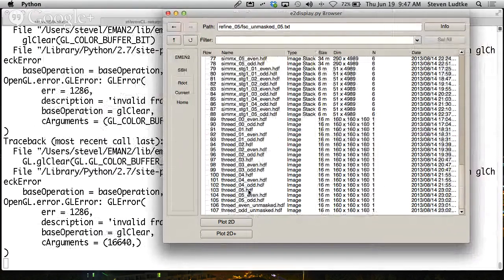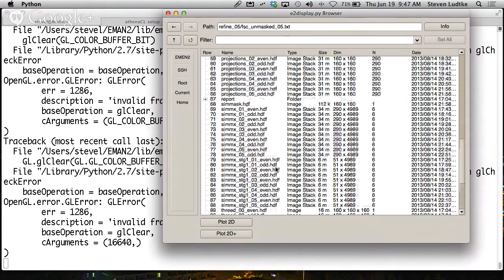If you don't have any symmetry to anchor the orientation, the one 3D volume is aligned in 3D to the other 3D volume just to keep them in the same general orientation, so when you do the resolution measurements, they come out correct. But that doesn't affect its shape or its structure in any way. It's just changing its orientation. If you have symmetry like icosahedral symmetry, that anchors the orientation and you don't have to do it. Yeah. So basically, those two refinements are done completely independently from each other.